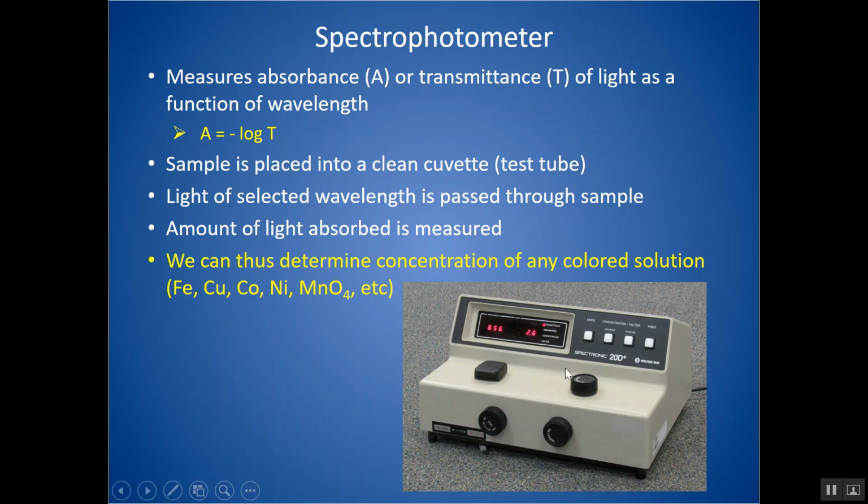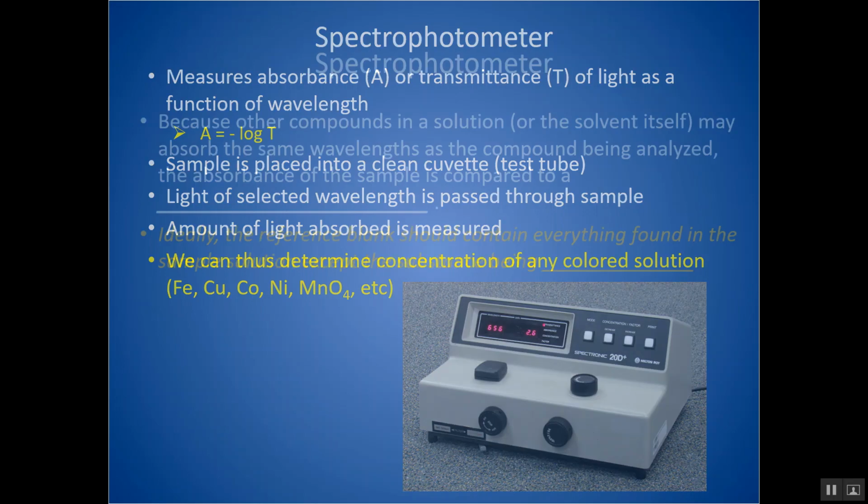Anytime you have a solution that has a color to it, you can relate your absorbance to concentration. If you just think about preparing a solution of Kool-Aid, the more solute that you add in, the darker and darker the color of your solution. So you can really relate absorbance, or the color of that solution and how much light passes through, to concentration.